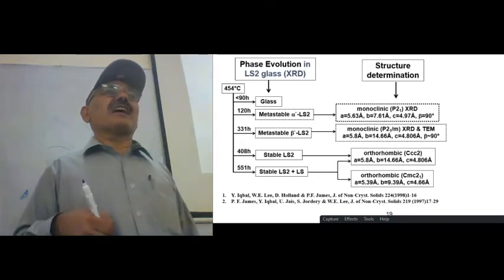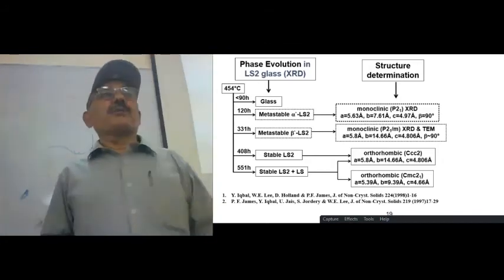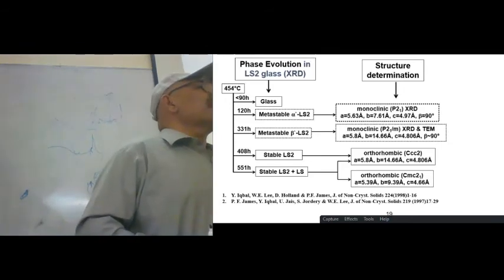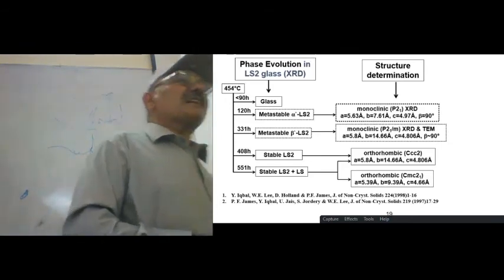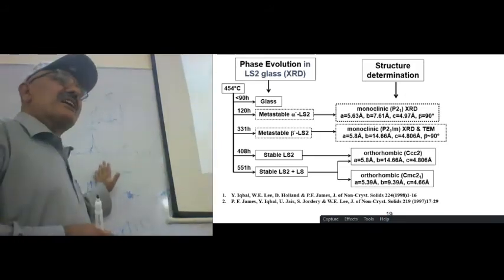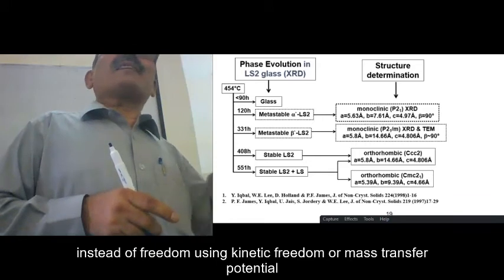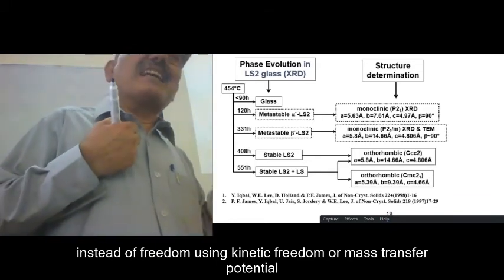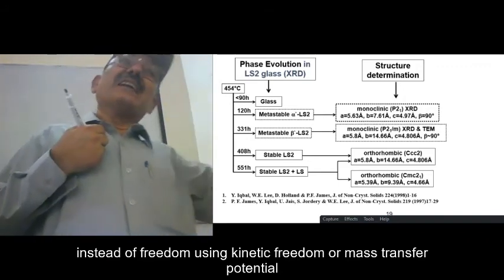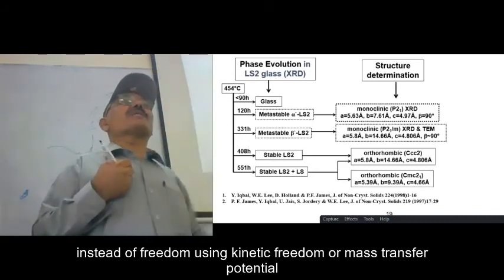This is just like all of you sitting in this room and suddenly going to the windows and putting your head like this. So from the outside, a person will see only heads. They will not see the bodies. So the crystals had A and B axes, but the preferential orientation just showed the C face to the X-ray. X-ray is not blind like us. It can see things. But the intensity of the diffracted rays from the C axis will be more in comparison to A and B.